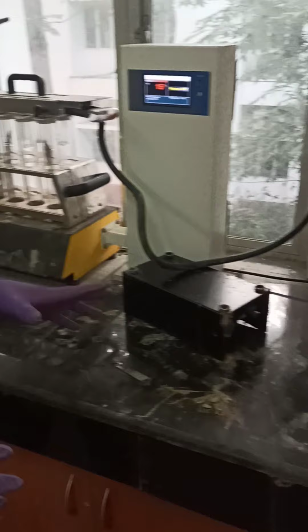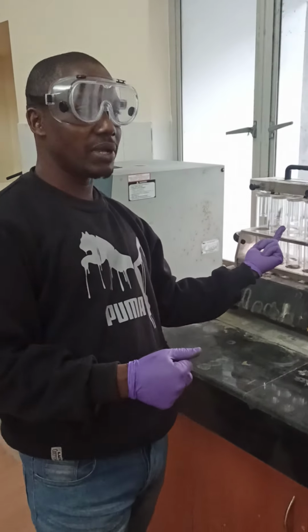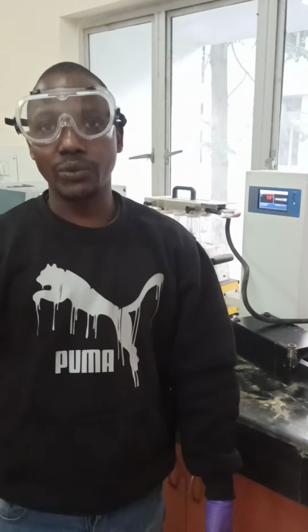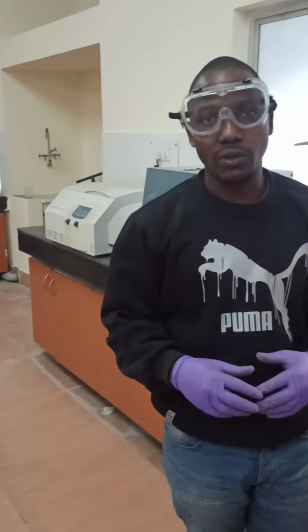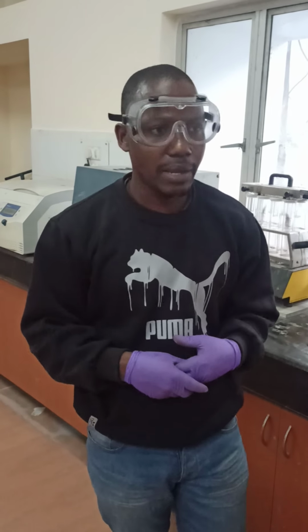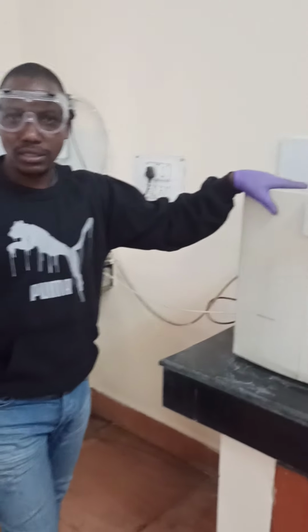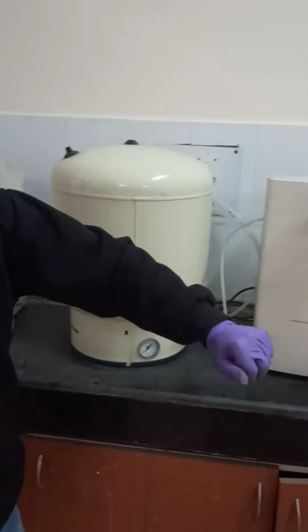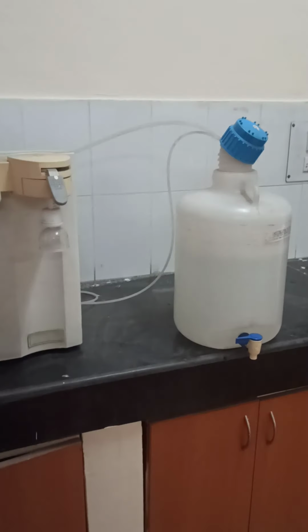And therefore, at the end of the day, I will have my samples digested and moved to the distillation unit. Then after the distillation unit, I will do the so-called titration, so that at the end of the day, I will be calculating the amount of nitrogen in the given sample. Apart from that, I am having the water filtration system. This is my filtration system. At the end of the day, I will be having distilled water.